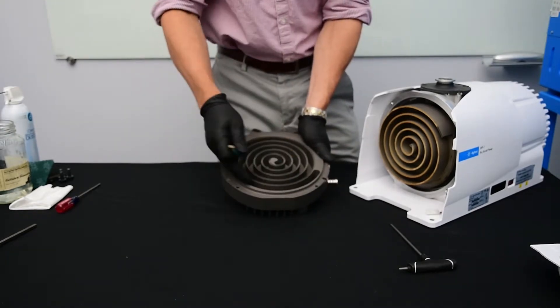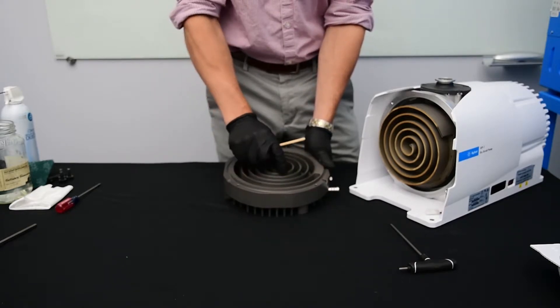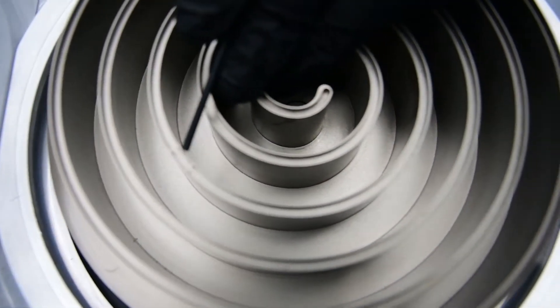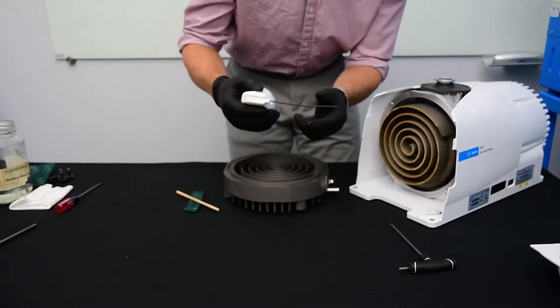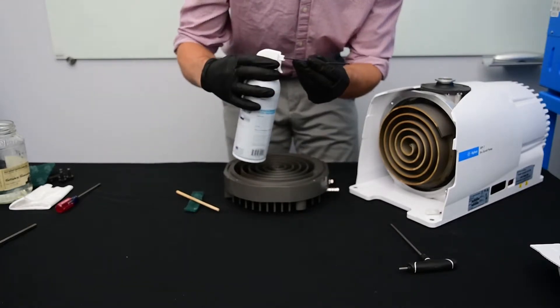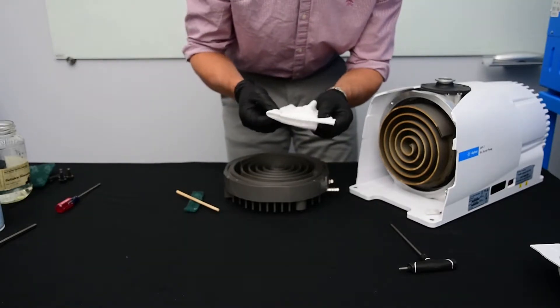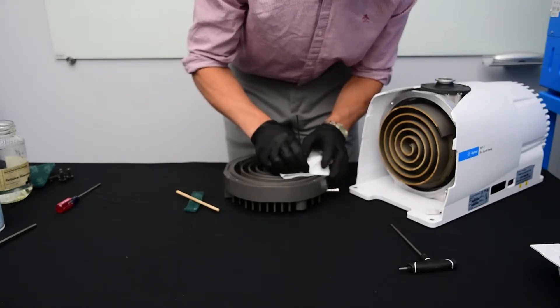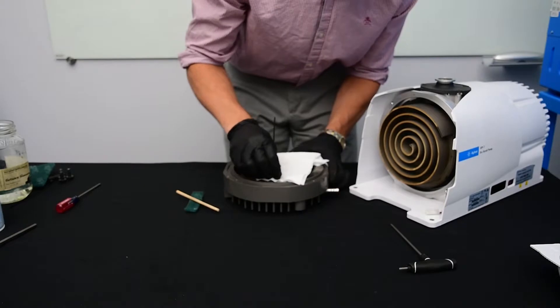Now once you've scrubbed out the inside of the tip seal groove, you're going to want to get in here as well. This dowel is too big, so I'm going to grab the straw from the top of my compressed air can. I'm also going to use my lint free cloth. Now lint free cloths are important. You don't want to use anything such as a paper towel when cleaning a scroll pump.